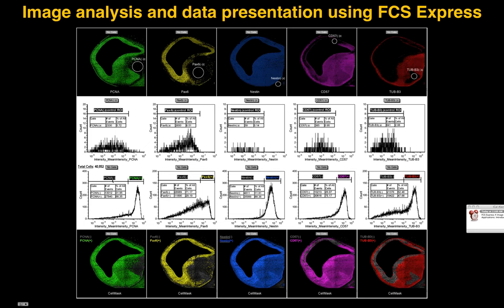And once we have identified both the negative and the positive cells, we can then recreate an image plot with the cell mask as a background. You can see the cell mask is like a grayed out area where all of the cells have been shown. And then, because we color-coded the positive cells in green, you can reproduce the original image on top with the masked image on the bottom, and you can see it's exactly the same image, but now we have quantitative assessment.